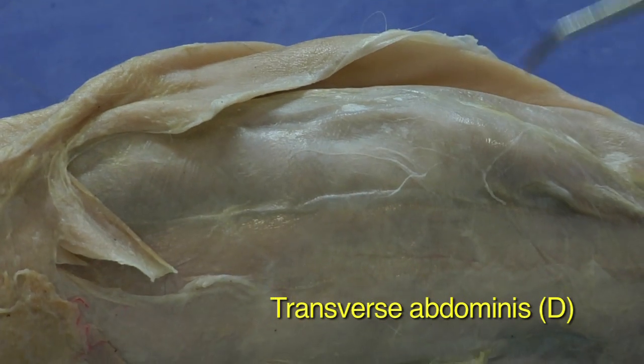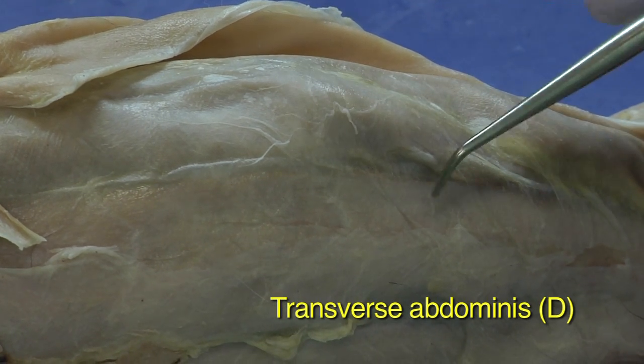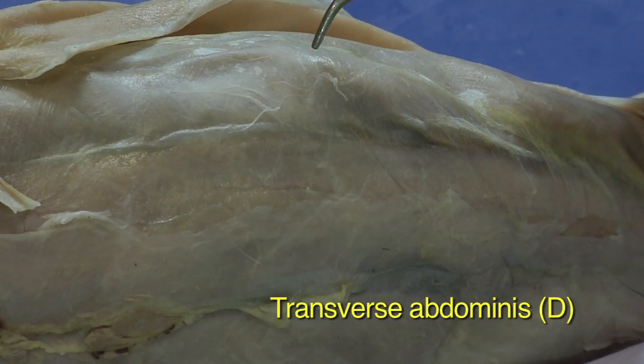If you see the stripe pattern there, that corresponds to the transverse abdominus.